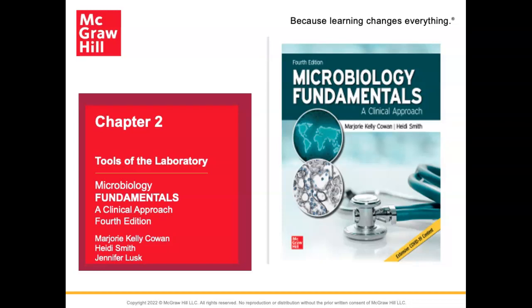Welcome to Chapter 2. Chapter 2 is mainly the tools of the laboratory. So we're going to talk about all the different things that are used in order to identify organisms. And this is part 1 of Chapter 2.